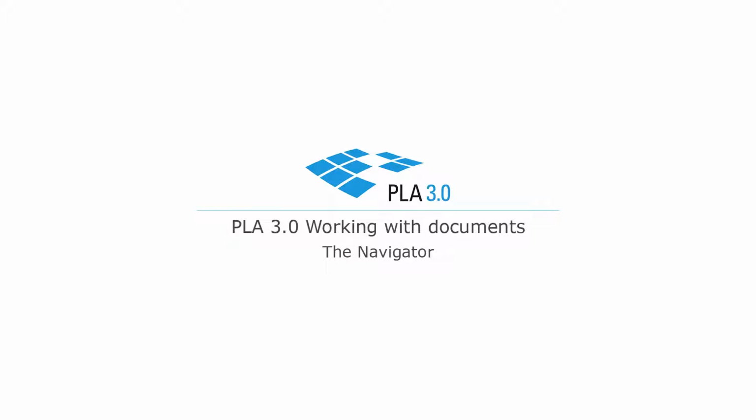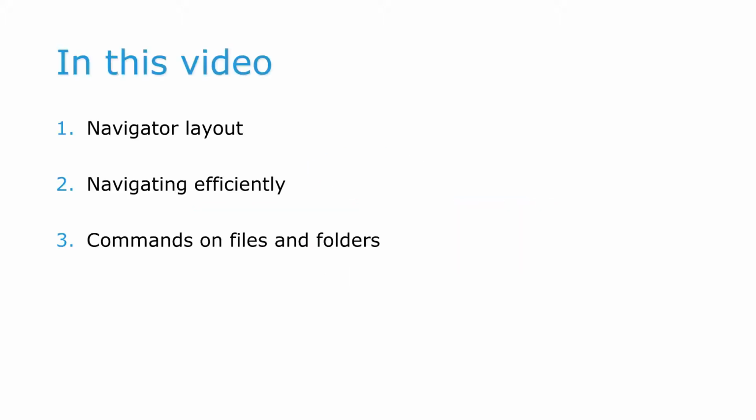In this video we will discuss the Navigator in PLA 3.0. We proceed in 3 steps. We first customize the Navigator's layout. We then discuss how to navigate efficiently. And we finally show you how to access commands on files and folders.